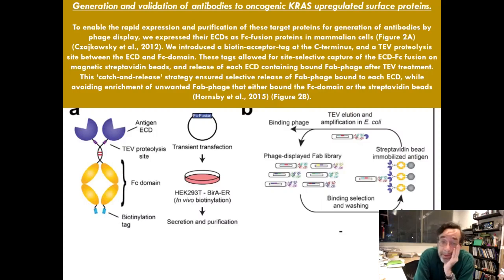This is really cool. It's also really hard to do, and this is what the antibot does. It's basically growing up a bunch of viruses. I wonder if Dr. Delgado would like to have an antibot, but she could use it for her own viruses. I don't know. It's pretty specific to phage display. But I'm sure she wouldn't turn it down.